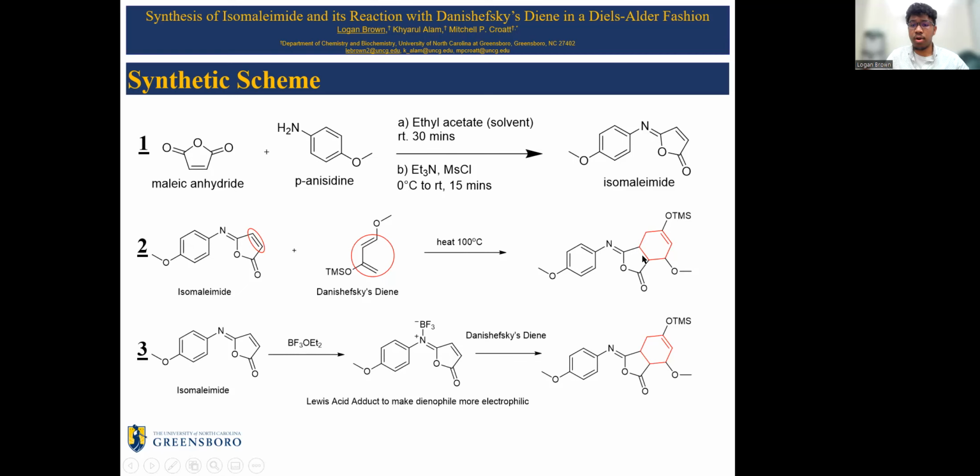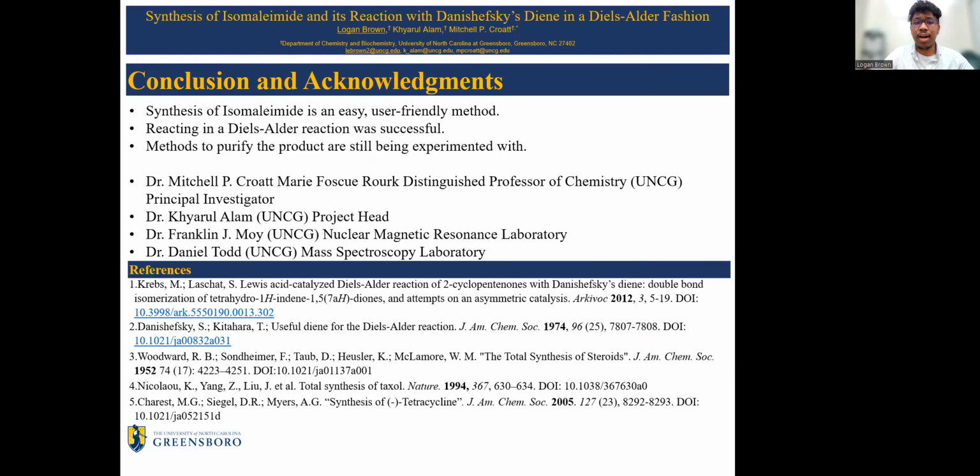And so this worked. In conclusion, the synthesis of isomaleimide was very easy and user-friendly. And reacting with the Diels-Alder reaction was successful. We were able to find proof that the reaction had worked. Methods to purify the product and avoid decomposition are still being experimented with today.